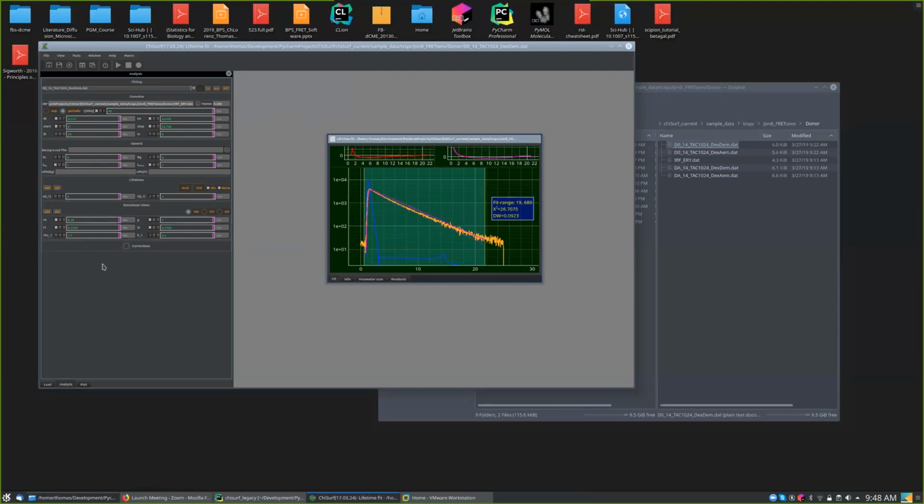Here, this is not relevant for this data set because we treated it as a magic angle data set. This is for rotation. So I recommend that you either fix these parameters or just delete the rotation, because then you have less parameters in the model. Okay. The next is for corrections. If you have a good instrument, you don't need it in principle, to linearize your model, I mean, to disturb your model so that it fits a nonlinear data set.